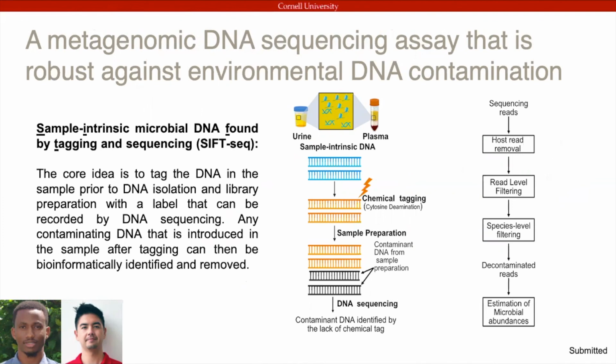And so for here, we look at different areas that are either C-poor or we look at the coefficients of variance across the whole genome. And from there, we can use different methods to set thresholds and figure out whether or not a molecule should be identified as a contaminant read or not. And our paper goes a lot more into depth into the actual tools that we use. So I recommend that if you're interested, you can look there to look at the exact tools and parameters we're using.